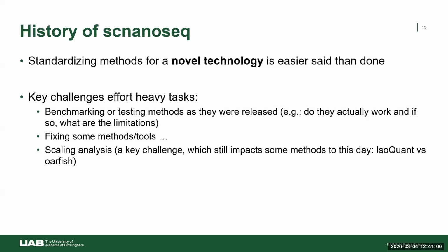And then scaling the analysis. This is definitely a key challenge for those of you who have not worked with single cell long read data. The data size is very different from short read data. We're dealing with way more data here. So I would still consider it challenging in some methods that we use today.